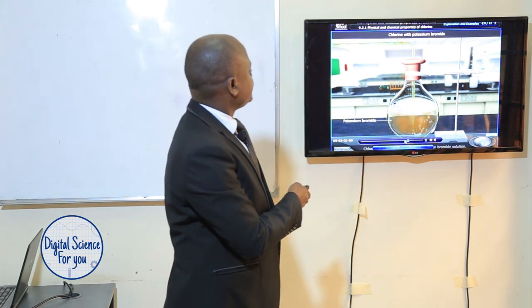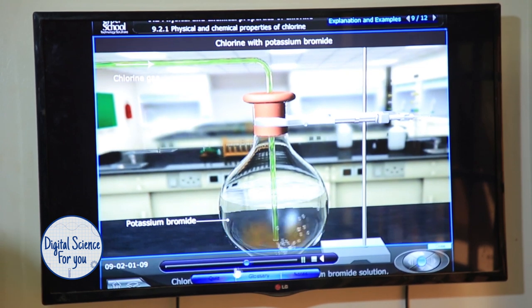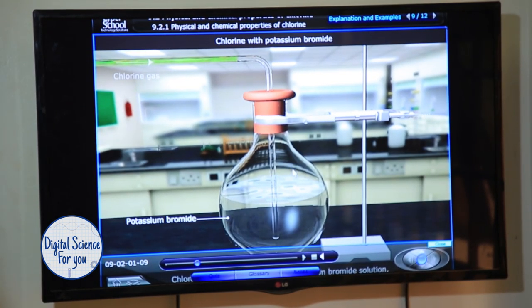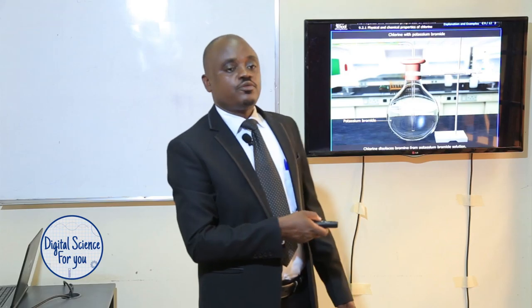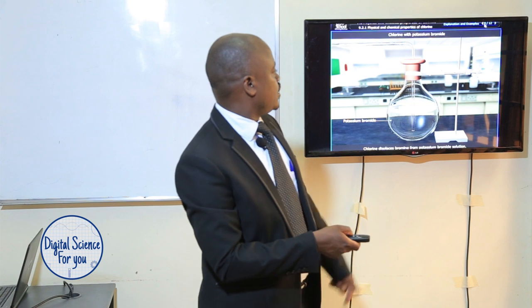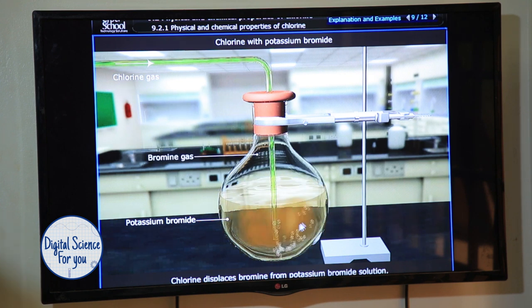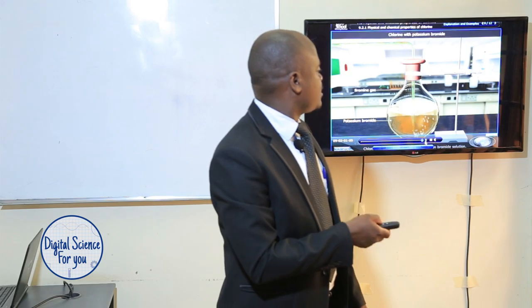Our next property will be how chlorine reacts with potassium bromide. Chlorine is bubbled through potassium bromide solution. At the beginning, potassium bromide is colorless. When we bubble chlorine through it, the solution turns reddish brown. The reddish brown color is due to the formation of bromine, which dissolves in solution to give us a reddish brown solution. This shows that chlorine is more reactive than bromine, and that is why it displaces it from its solution.